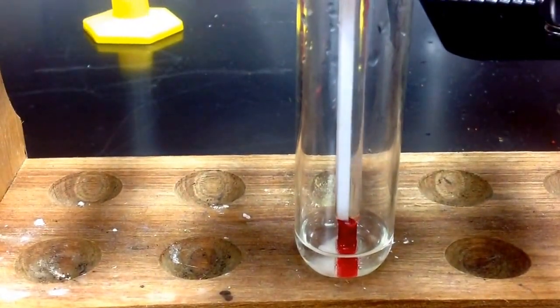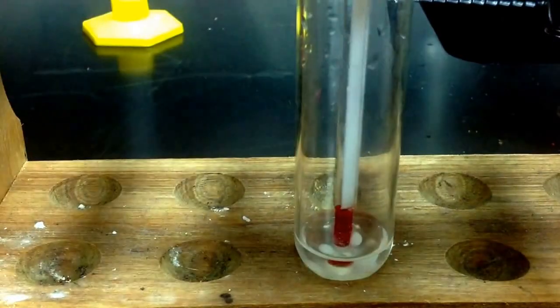Oh. Well, it wasn't facing you. You've got to turn your thermometer until it faces you.